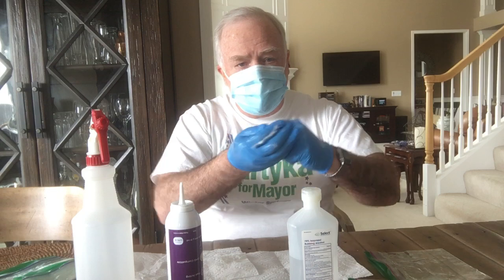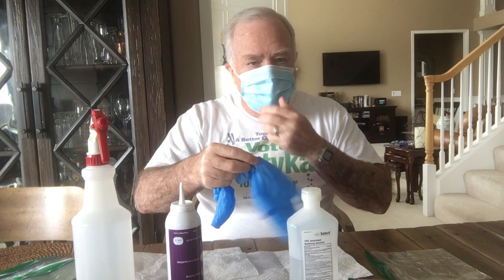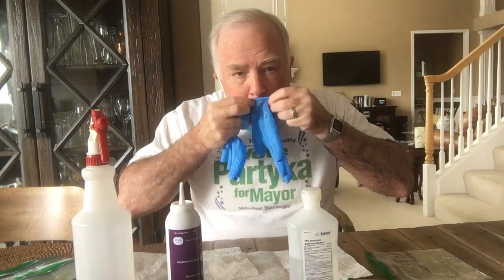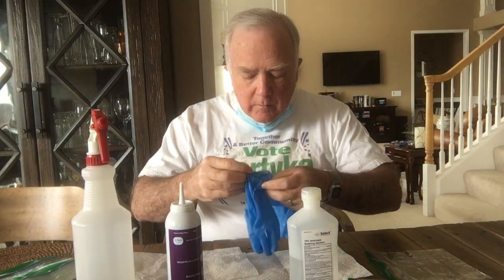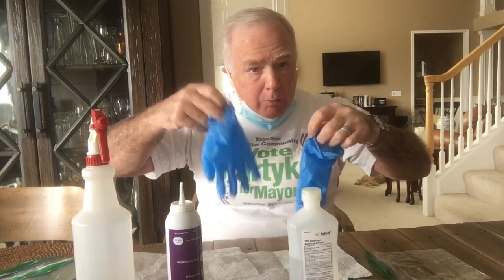Now I can reverse the gloves like this and blow them out — and now these gloves are sterile on the inside and can be reused. Some people ask: aren't you blowing germs in there? Well, there's still alcohol permeated on the inside, so any germs I blow in would be dead — plus I'm the one going to be using them anyway.